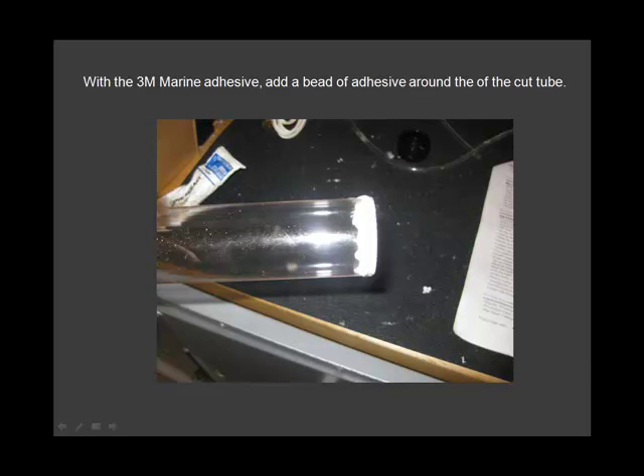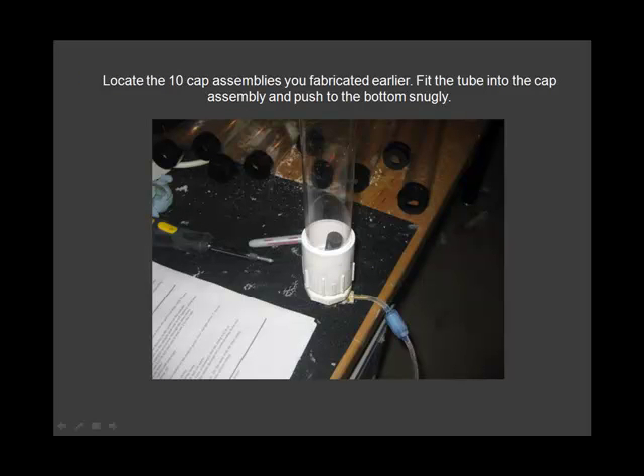Add a bead of adhesive. Locate the 10 cap assemblies you fabricated earlier.